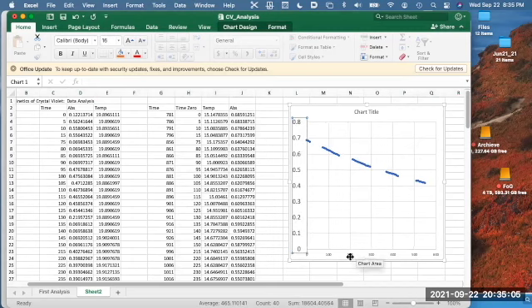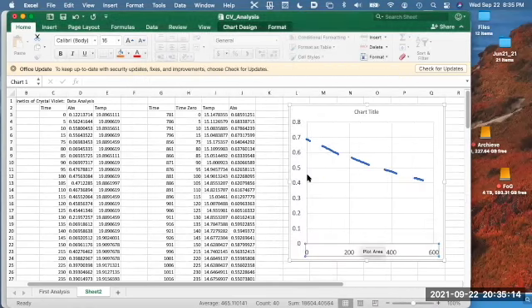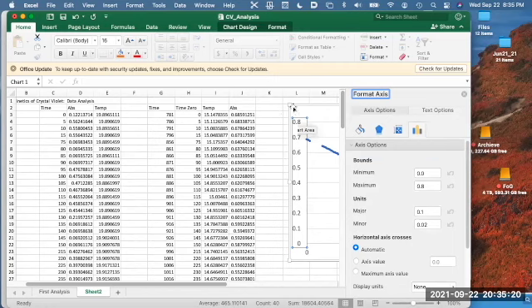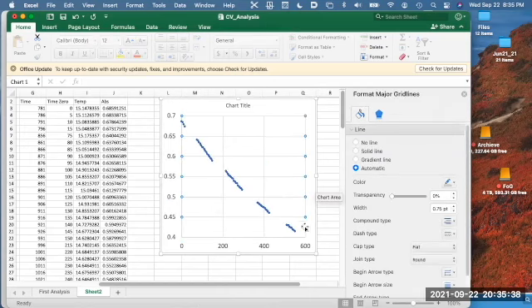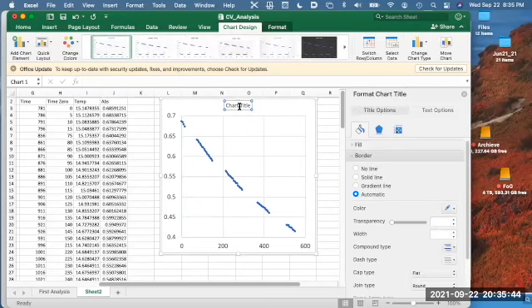What I do next is I click on the axis, Command T while I clicked, and that contextual menu pops up, and I can change the size of the font. And if I click on the axis, I can get the axis format. Again, Command T will work, and then I can scale the graph so it takes the full page on that graph.